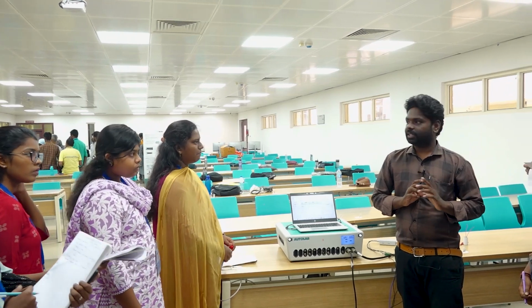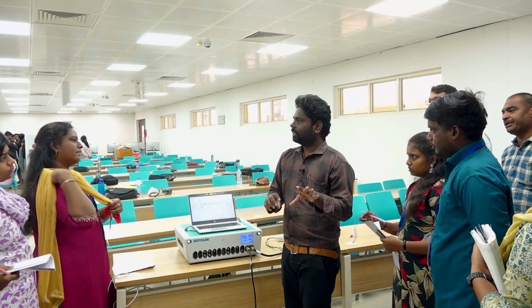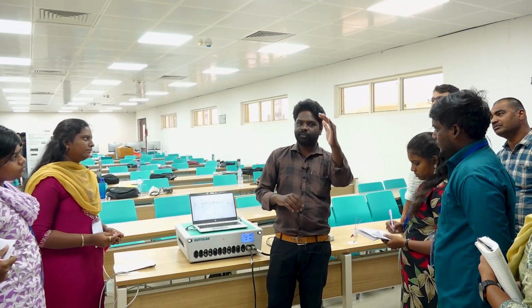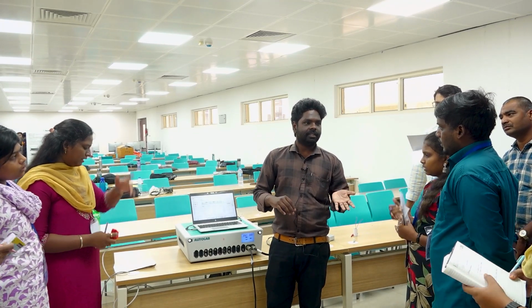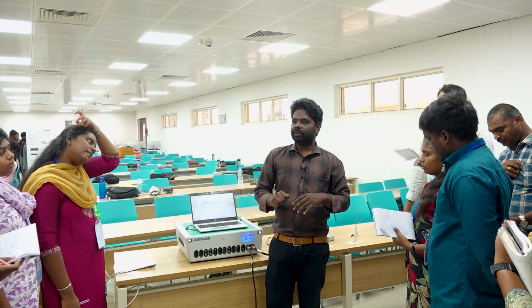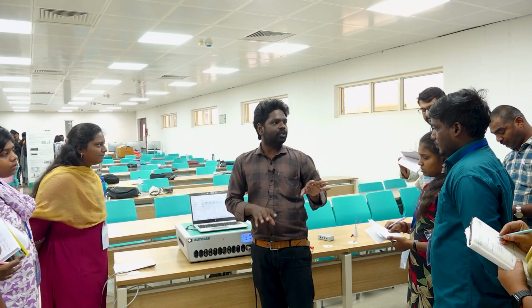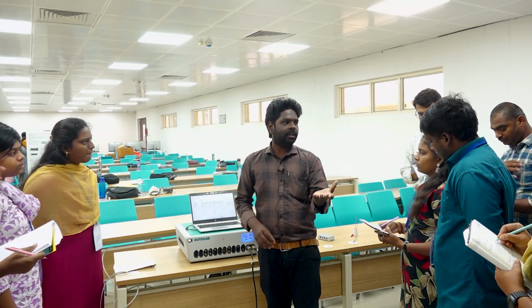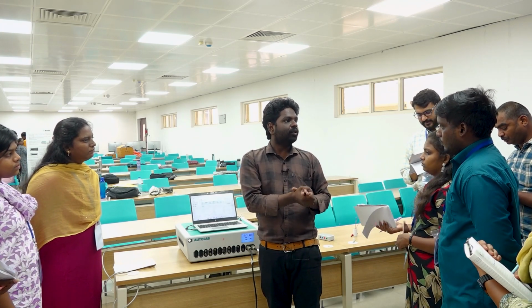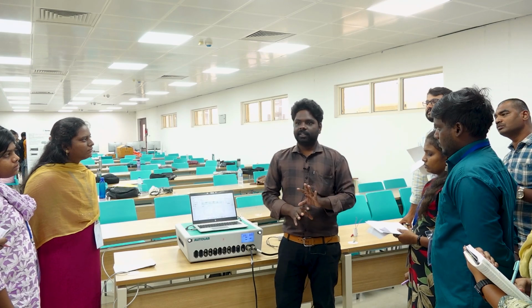We were talking about Warburg. What is it denoting? Diffusion, right? So what are the four things we have covered? What is another name for internal resistance? We have solution resistance. If you take any sample, these are the four major characters of our sample. If you analyze the character of these samples, that would be very useful to define our sample. Okay, clear, right?